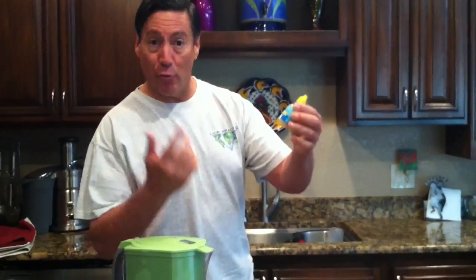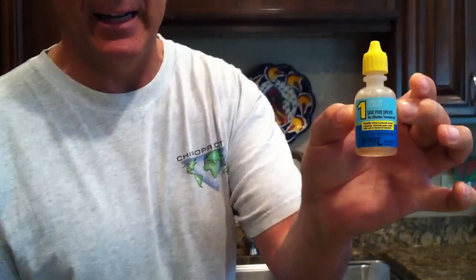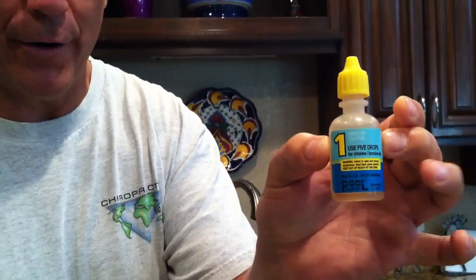This morning I'm going to demonstrate why it's important to drink good filtered water and how to tell if it's good filtered water. Number one, we have these drops — you can get them at Home Depot or Leslie's Pool Supplies. They're basically drops to test the chlorine in the water.